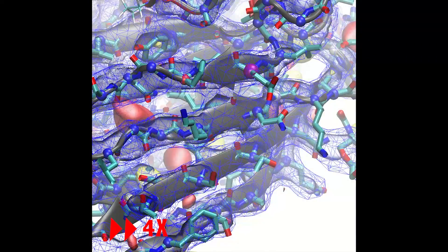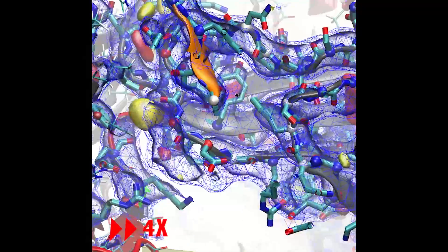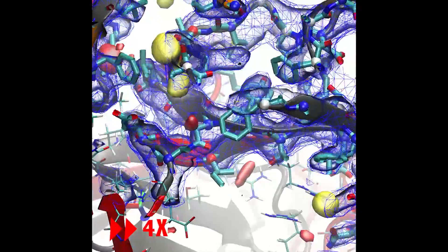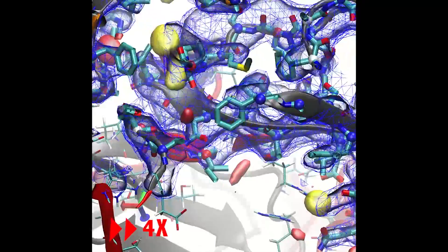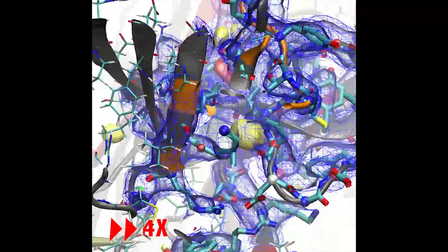This is simply a further application of the same essential methods, using scripted forces to push the register shift while manually adjusting the surroundings, but provides a particularly useful illustration of how the IMDFF environment allows the user to very rapidly trial a wide range of alternative confirmations.